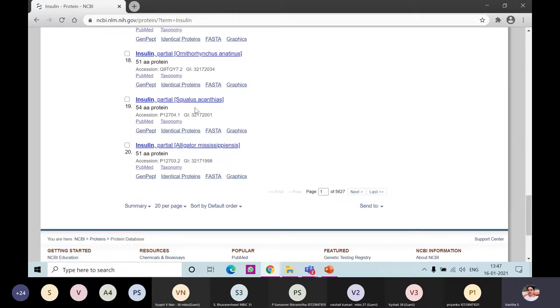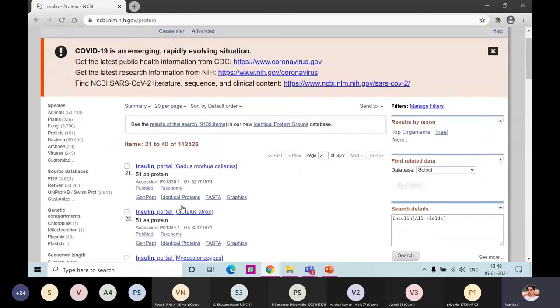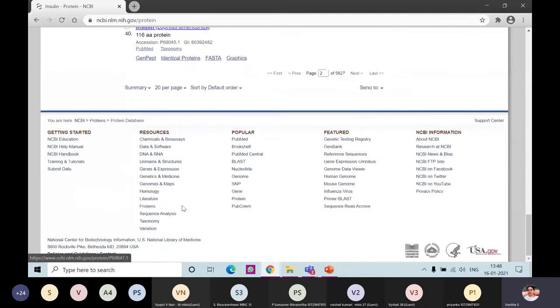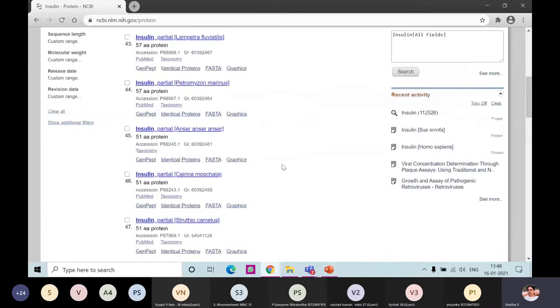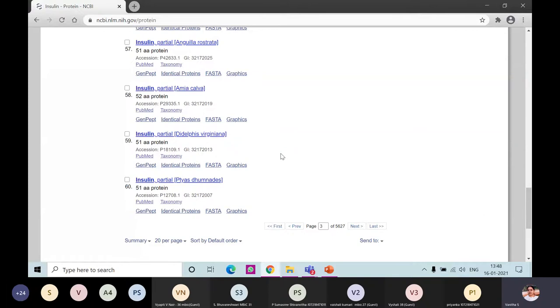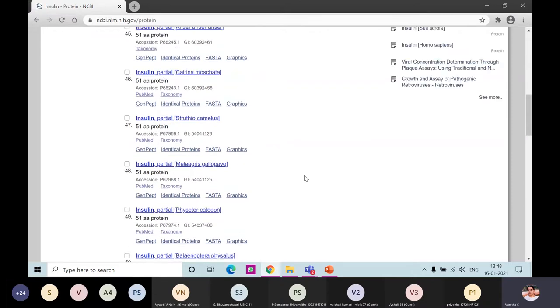You'll also see insulin Gallus gallus, insulin partial, alligator insulin partial - don't go for these partial sequences. The first page shows results 1 to 20. Click 'Next' and you get 21 to 40, then 41 to 60, and so on - all results related to insulin. You can see how many pages there are. We are only on page three and there are many more pages of insulin-related proteins, but I want only the main insulin protein.